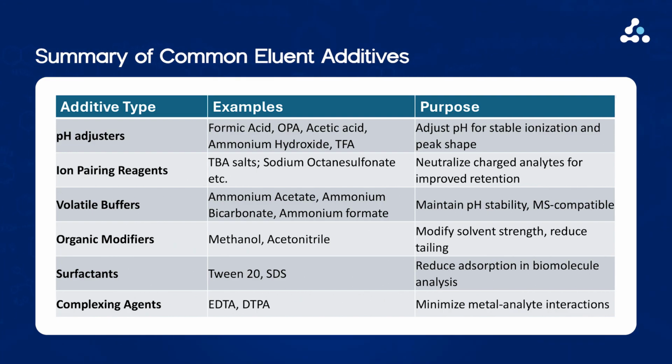By carefully selecting and optimizing eluent additives, analysts can achieve high resolution, sharp peak shapes and consistent retention times in HPLC applications across various fields.